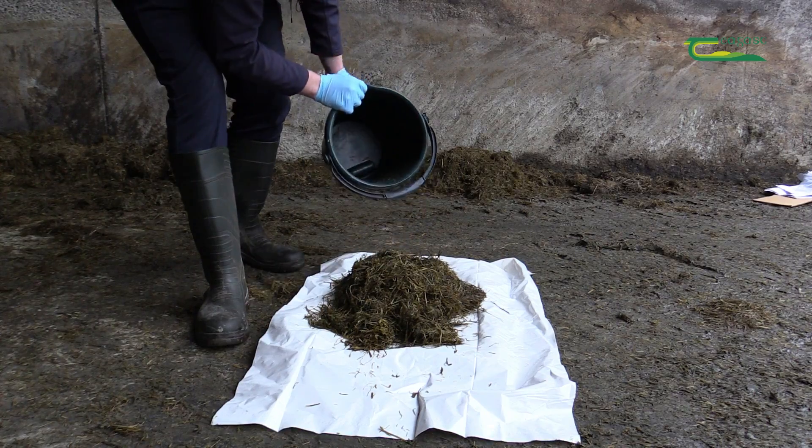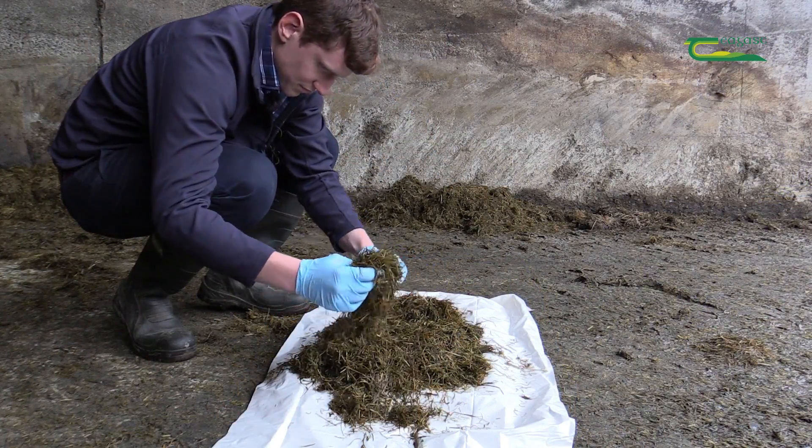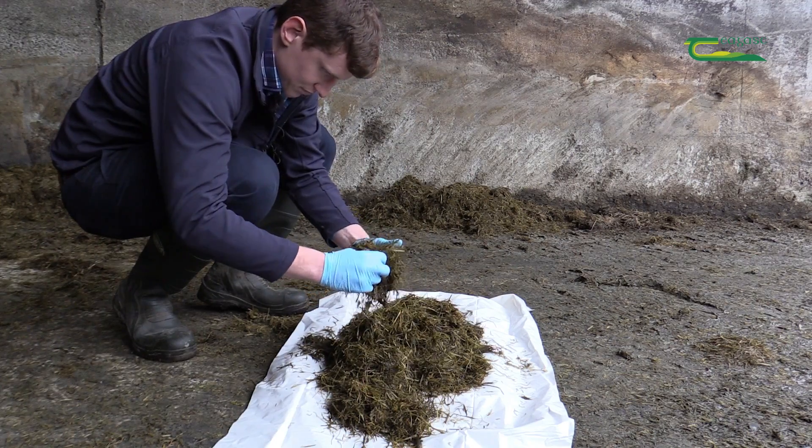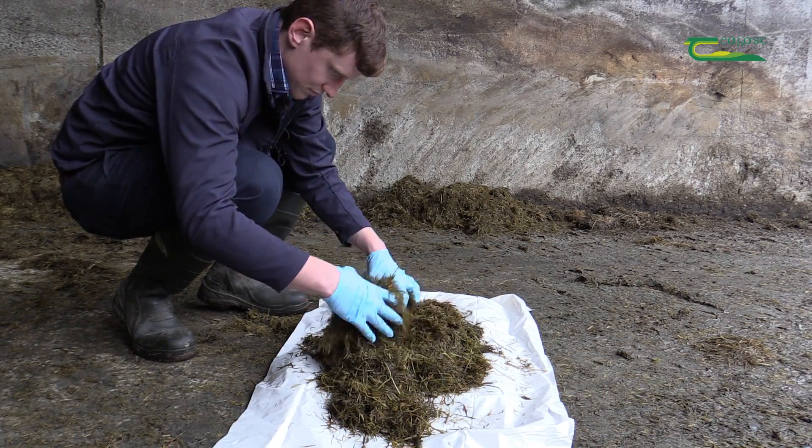Tip onto a clean board or worktop to prevent contamination. Thoroughly mix the sample ensuring even distribution throughout. A minimum of 0.5 kg is required by the laboratory for testing.